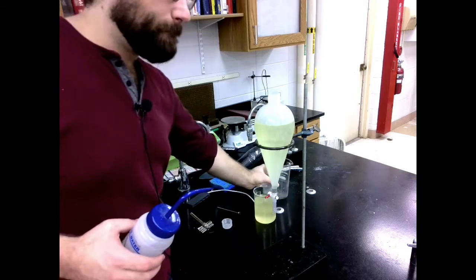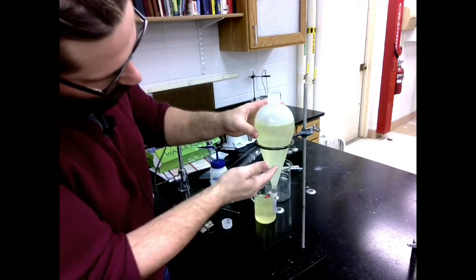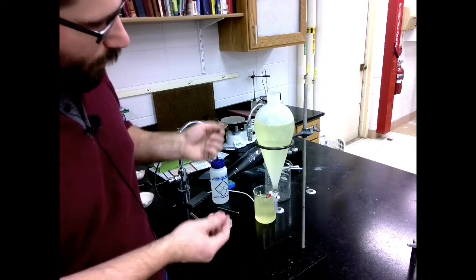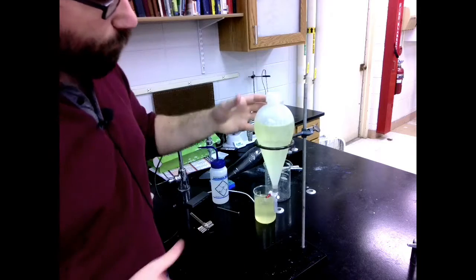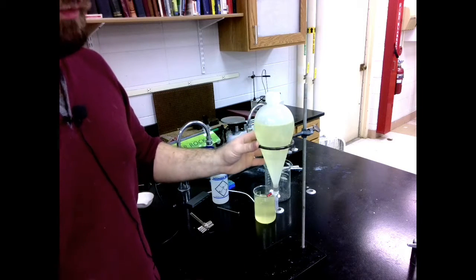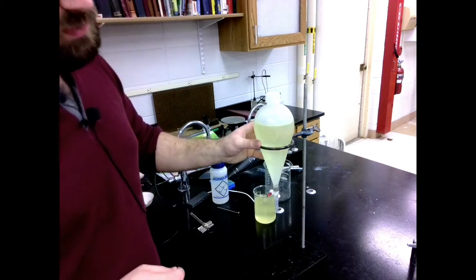Okay. Next, because I just swished all of that around, I need to give time for the water and the oil layers to separate from each other. So I'm going to place my cap on top of this, and I'm going to let this sit for about an hour or so. Likely for you in class, you'll set this up, you'll go work on something else, and you'll come back the next day to have these layers separated.